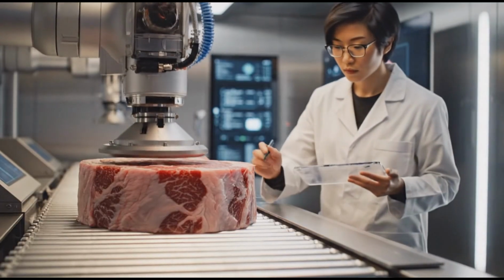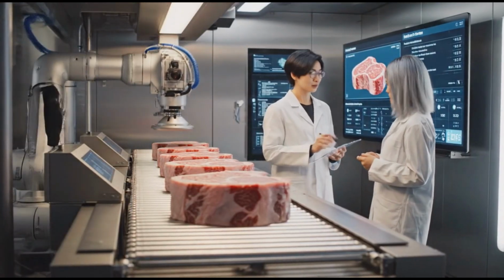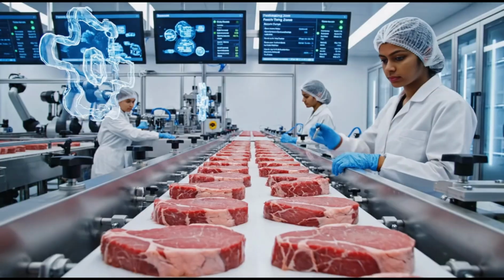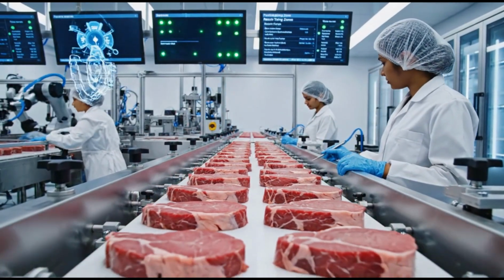Structural alignment is optimal. Confirmed. Integrity check passed. Releasing to next phase. Uniformity check complete on batch 42. Confirmed. Proceed to packaging.